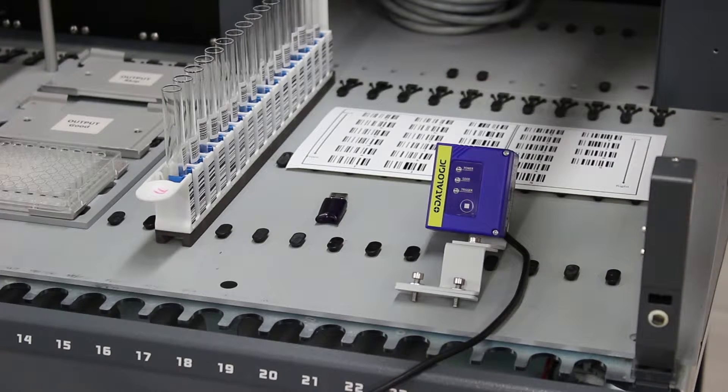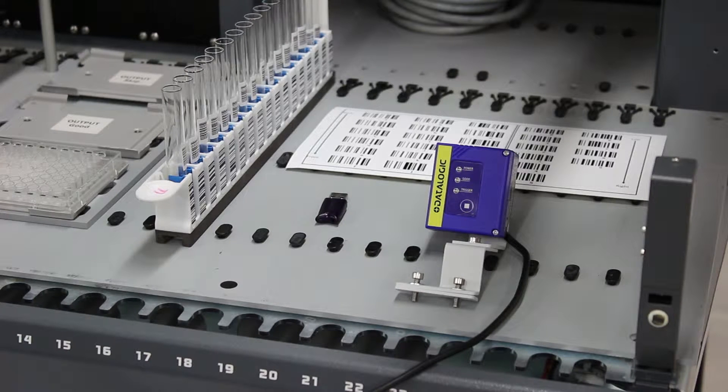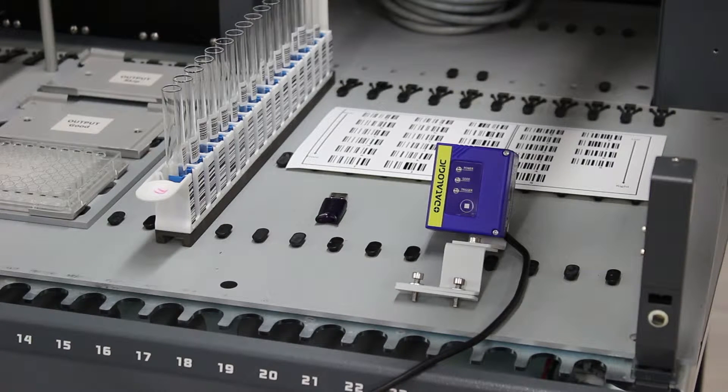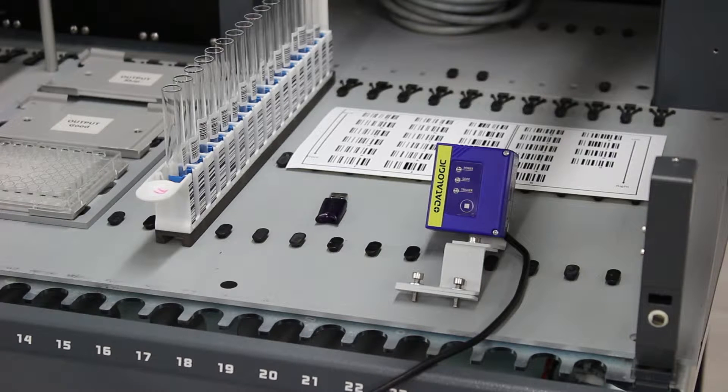The TubeID is a low-cost, low-maintenance solution for sample tracking on all TICAN EVOs, including the EVO 75.